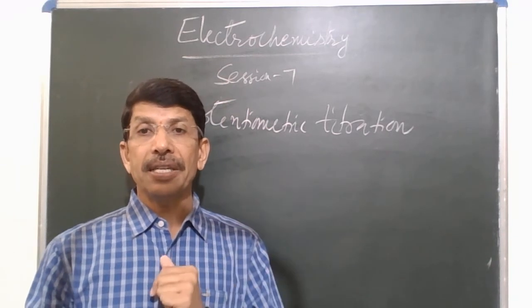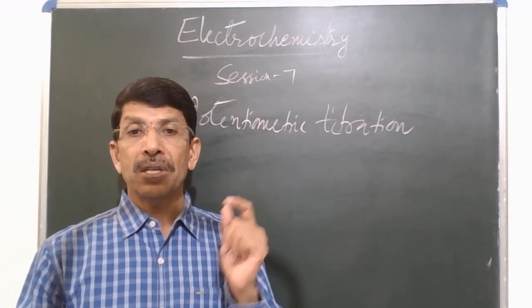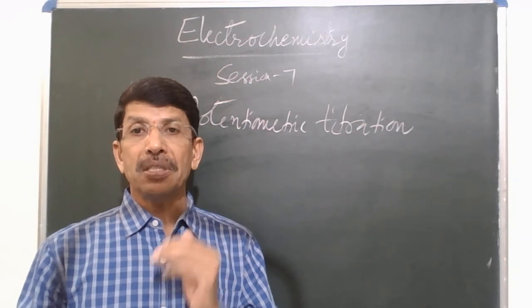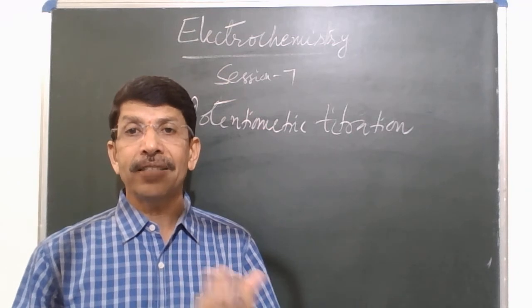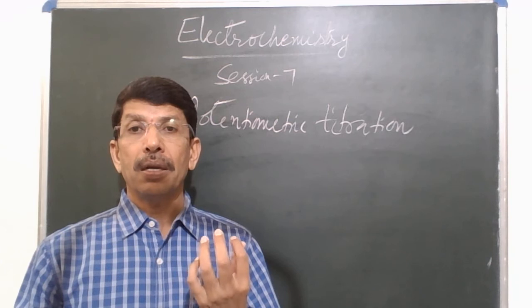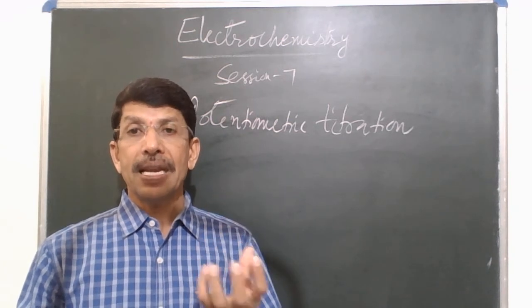And in potentiometric titrations, volume of titrant versus EMF. From these graphs, it is possible to determine the volume of titrant consumed by a known volume of titrand taken in the titration vessel. This is the principle in the instrumental methods of titrimetric analysis.